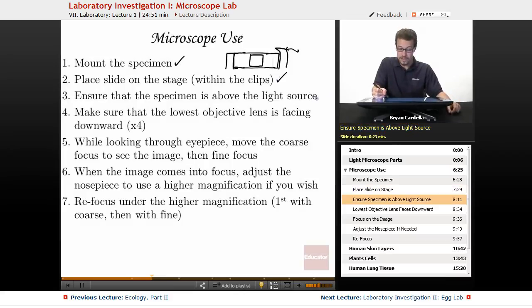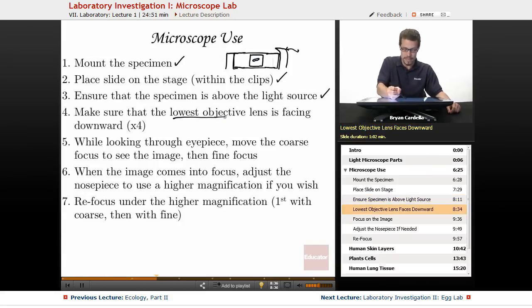You also want to ensure that the specimen is above the light source. One of the biggest troubleshooting things I've had with students where they spend five minutes trying to find the specimen and trying to see the cells and like I can't find it. A lot of times the specimen isn't above the light source. They're just looking at another part of the slide. So you have to make sure that if there's a tissue here that is right above the light source on the stage. Also make sure that the lowest objective lens, it's usually that red one, the one that's times four, total of times 40 magnification with the eyepiece, is facing downwards. See, there it is times four.